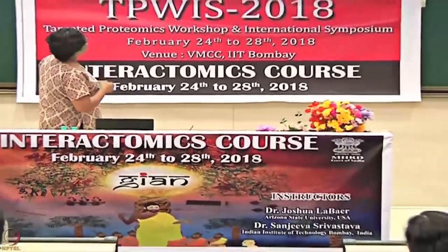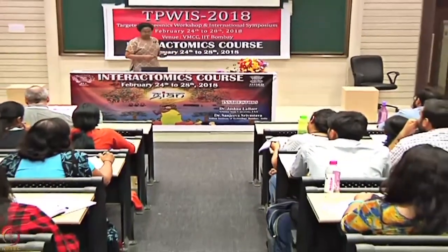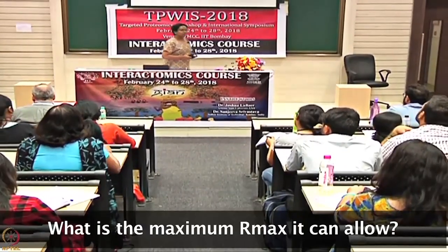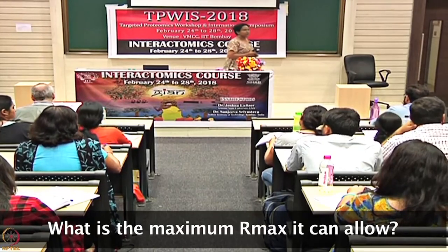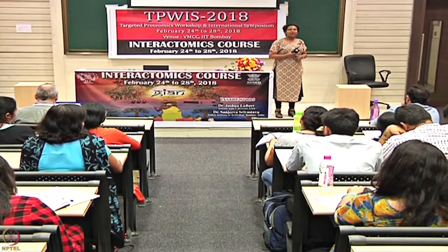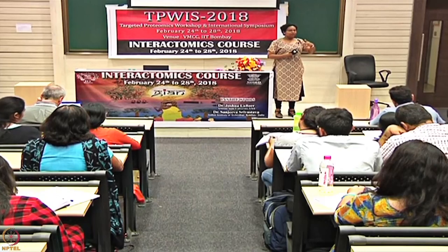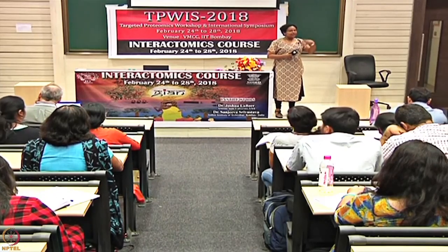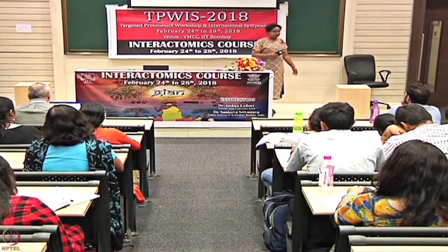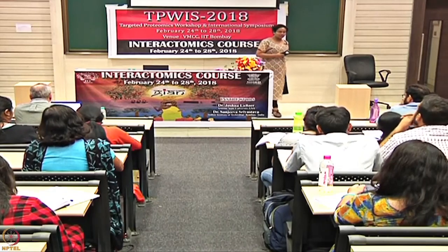Analyte molecular weight is not given, so we have two unknowns in that. No, analyte molecular weight is there. The maximum R max that we can allow, well, it can allow a lot. It's not about the T200 allowing it. It's the analyte and the ligand molecular weight which will contribute to it. Five RUs of R max. Yes.